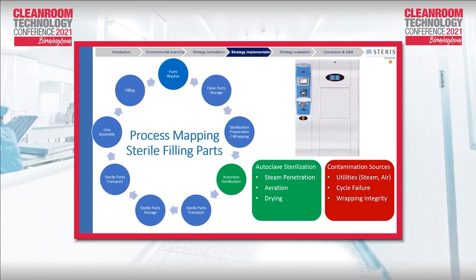And then the most important step is really to autoclave this part, where it takes into account ensuring steam penetration, adequate aeration, so removal of air, and an adequate drying step to prevent any water inside the sterile part when you open your autoclave.